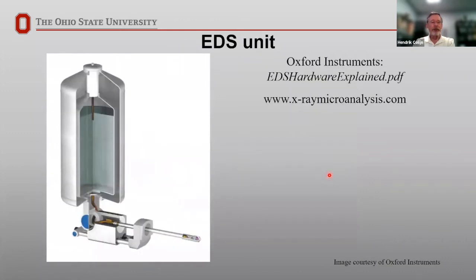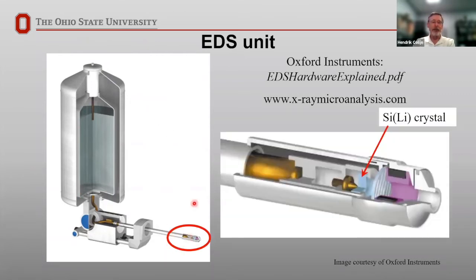Now, you may have seen pictures of these detectors sitting on microscopes. The detector unit looked almost as large sometimes as an SEM column, but you'd see these hanging on the sides of TEM columns as well. And they look very impressive, but the whole thing, this big unit on the side, is just holding a lot of liquid nitrogen, just a big dewar. All the work actually got done down in the tip here.